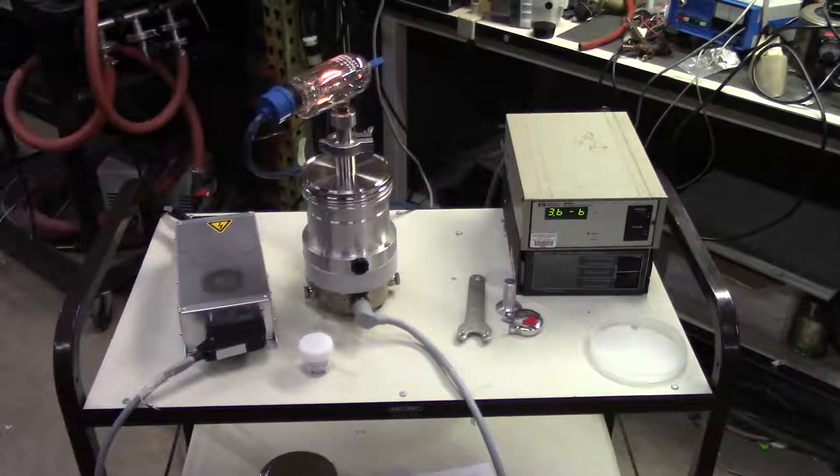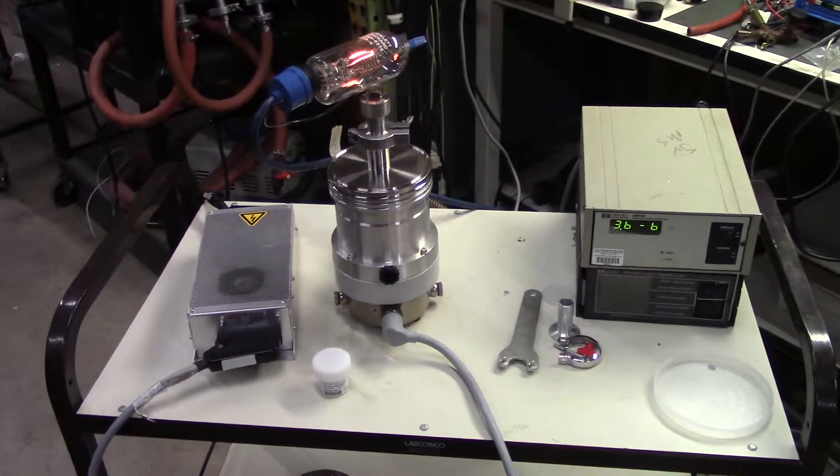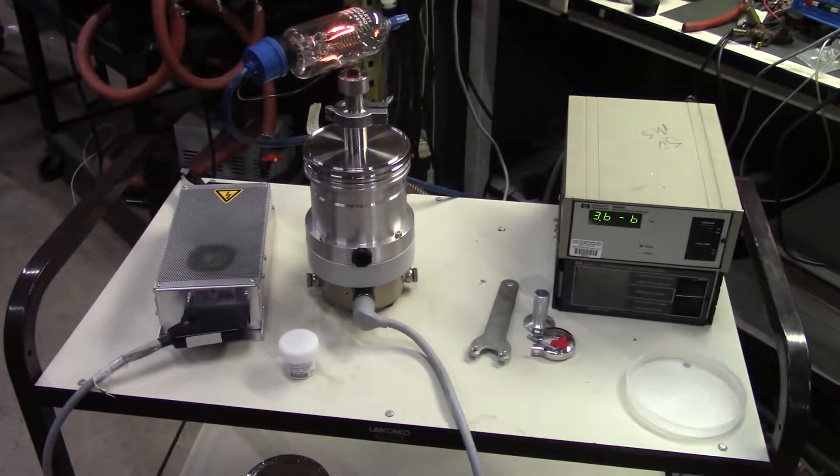Hello, this is John for HitechTrader. What we have here is a tested Pfeiffer turbo pump and turbo pump controller.